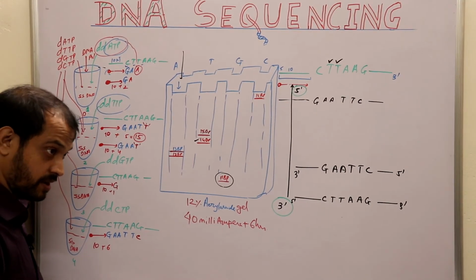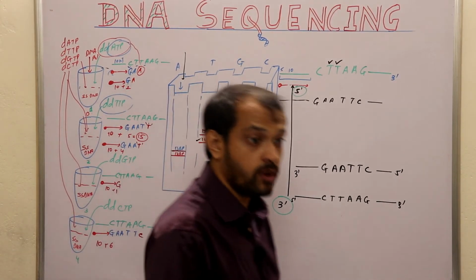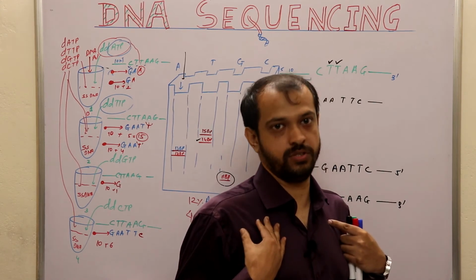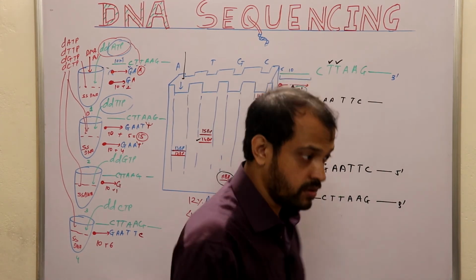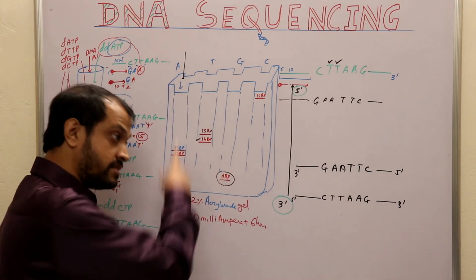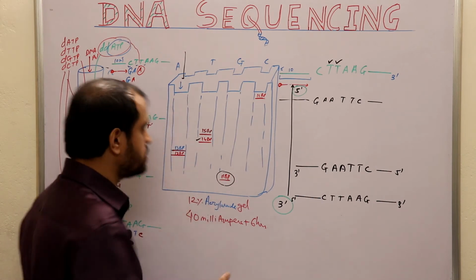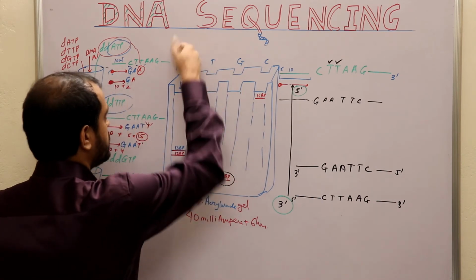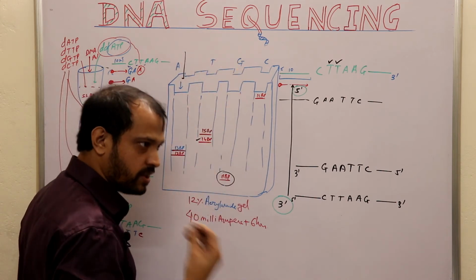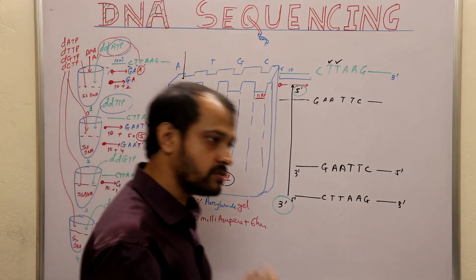Number two, you need an enormous amount of inner peace. Why? Because suppose you are loading 100 of these things, and suppose for only one thing you have loaded A in the T column, the entire thing is gone.